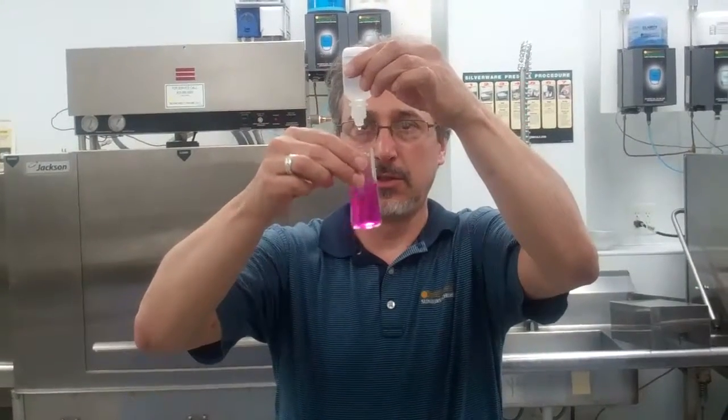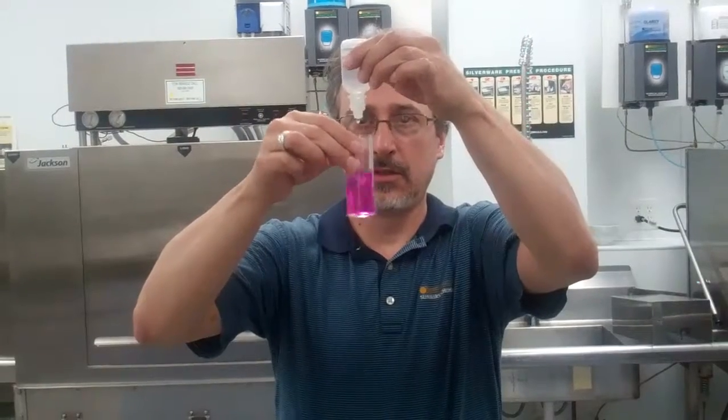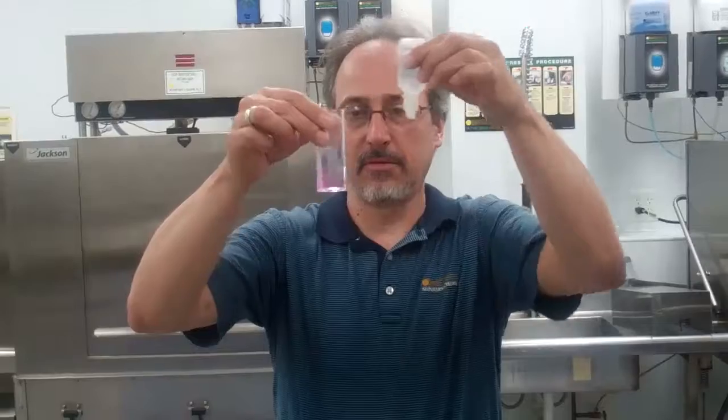One, two, three, four, five. And you can see that cleared. So that would be 250 parts per million. Thanks and have a good day.